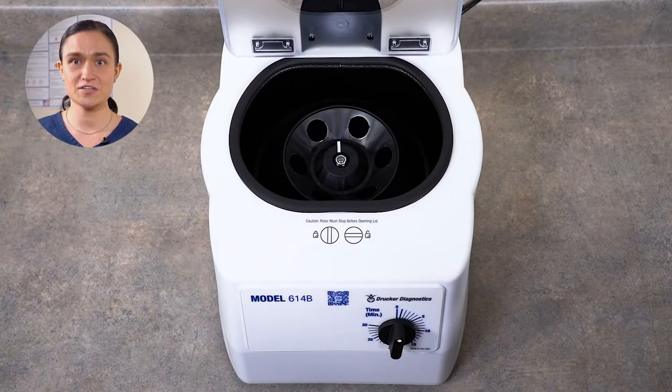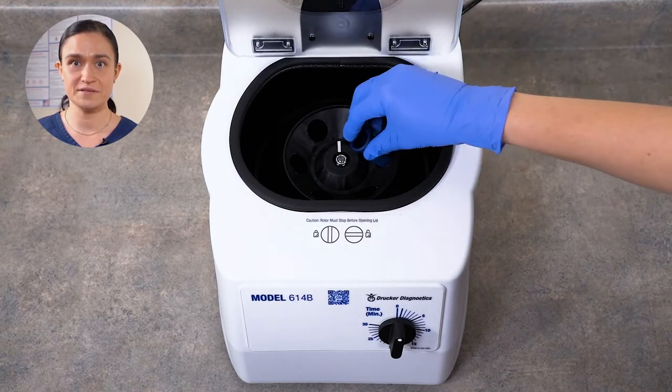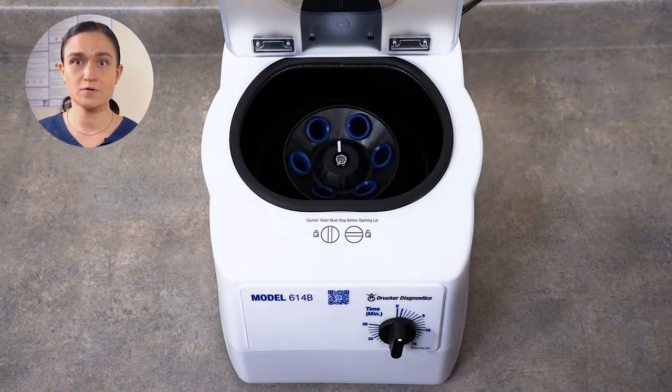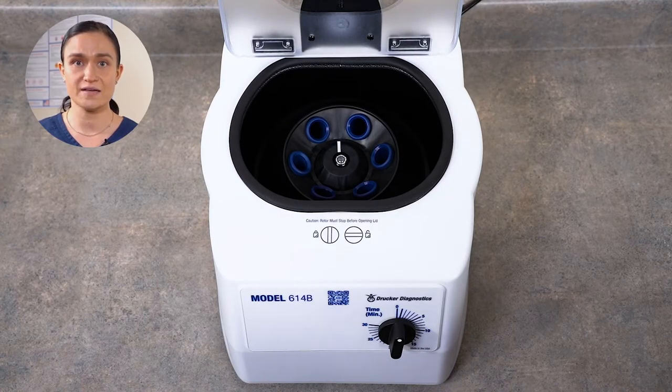Now let's look at how to load your 614B and spin your first samples. Part 4 – Spinning Samples. When loading the 614B, or any centrifuge, it is important to make sure you load the samples in a way that keeps the rotor balanced. Loading balanced samples helps keep the lab safe and ensures the maximum lifespan for your centrifuge. Step 1: Make sure that all 6 tube holders are properly seated in the 614B rotor. You must run all 6 black or all 6 blue tube holders — do not mix them. They do not snap or click into place, but should be seated one per slot in the rotor.